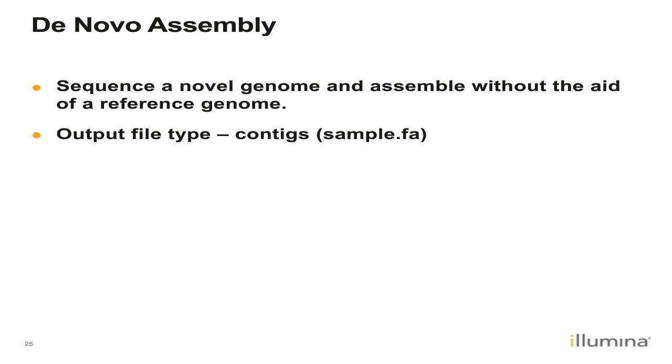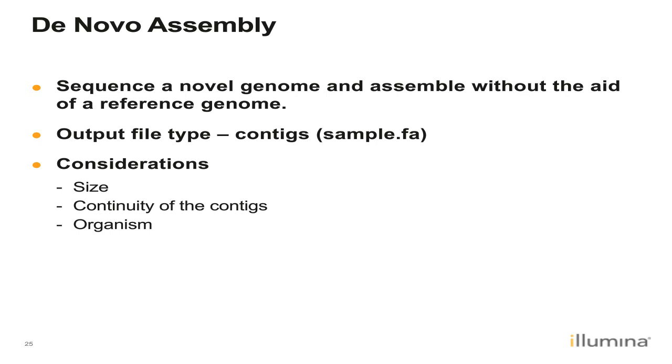So some considerations with de novo: the size of your genome. Although we're doing this for the first time, you should still have an idea of what the size of the genome is going to be, either based on other organisms that exhibit similar traits to your organism of interest, or by other means. You should have some idea of what this genome size is going to be.